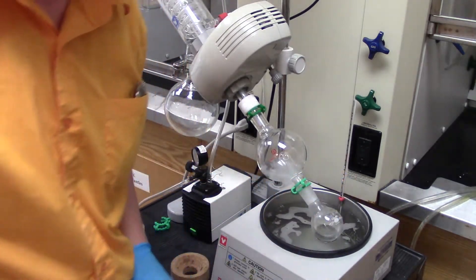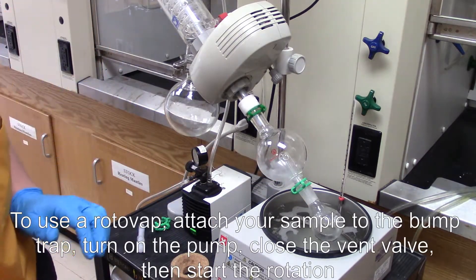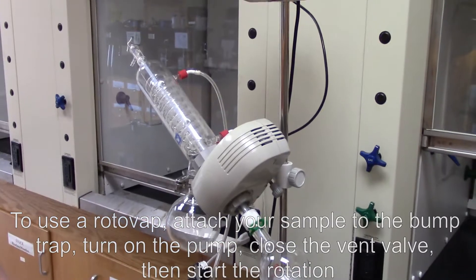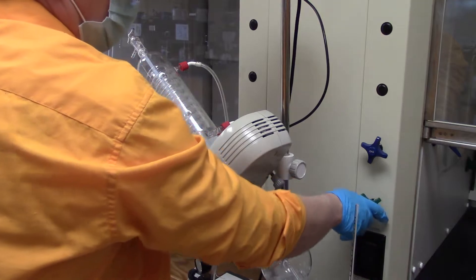So to use a rotovap, what you want to do, attach your sample to the bottom. One thing you never want to do is seal this valve first. So the first thing we're going to do, if it hasn't been done already, turn the cooling water on.